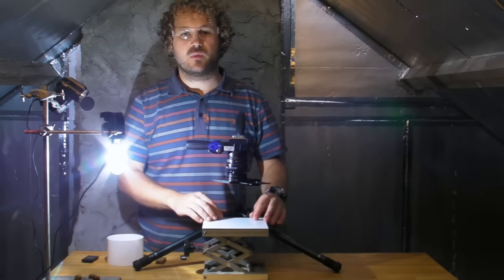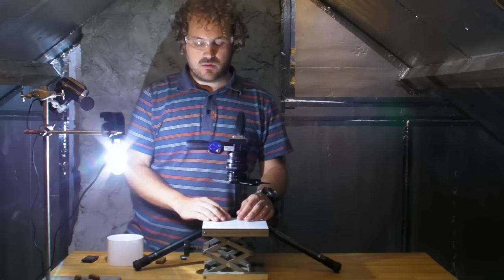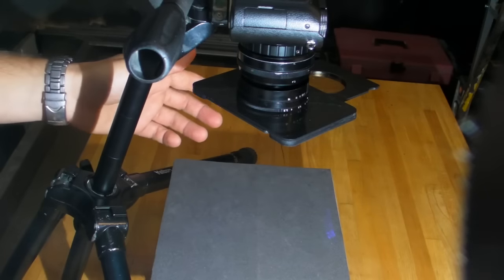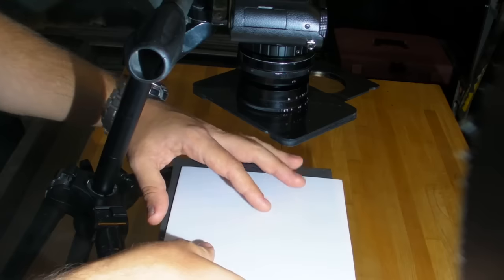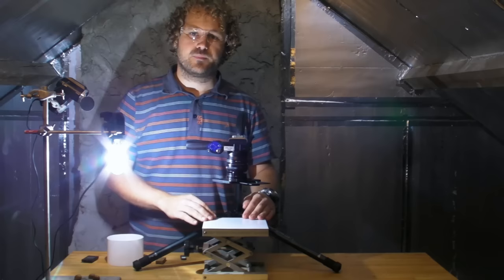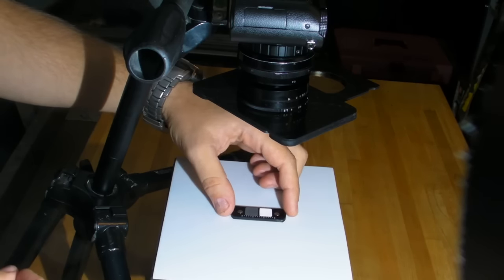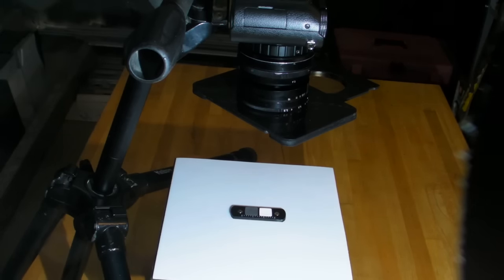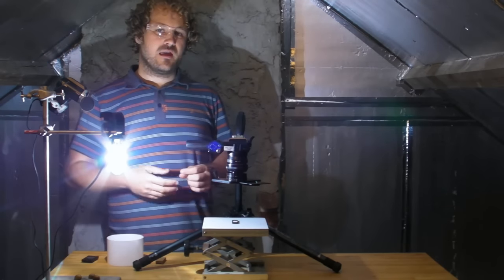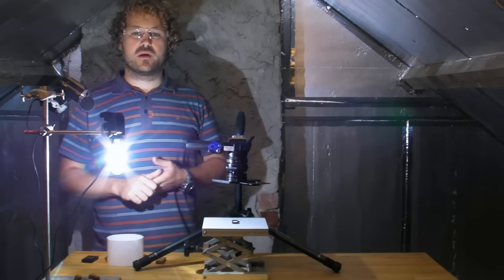Another part of the scene that you should consider when photographing in artificial conditions is the background. Here I've used a PTFE sheet as a background, 1.5mm thick, so it's nice opaque white. You can also use a grey background if you want, but whatever background you use, ideally it should be spectrally flat, so that it reflects the same amount of UV as it does visible light. If you were to use a coloured background, then coloured light could spill off that background and onto your sample. And if you have a grey standard positioned like this, in the same plane as the background, sitting above the background, then none of the light spilling off the background will actually hit the standard. So the standard can't control for the lighting changes if you were to use a coloured background. So the only coloured backgrounds you should use are ones that would be ecologically relevant for the thing you're measuring.